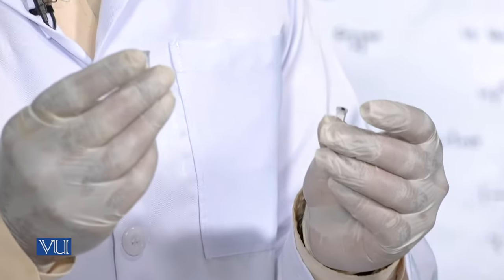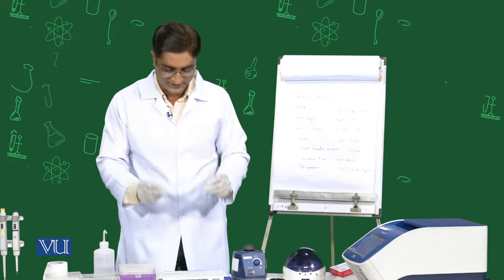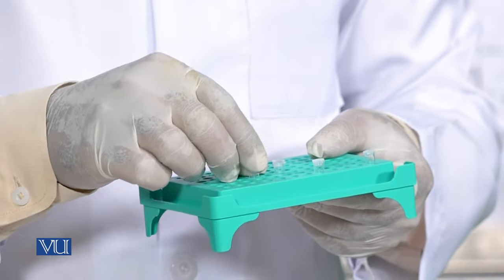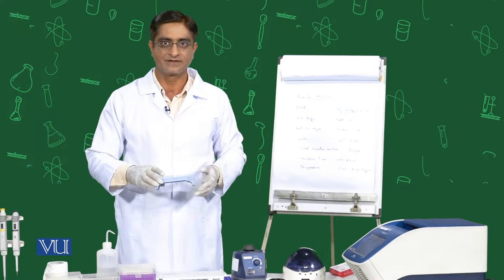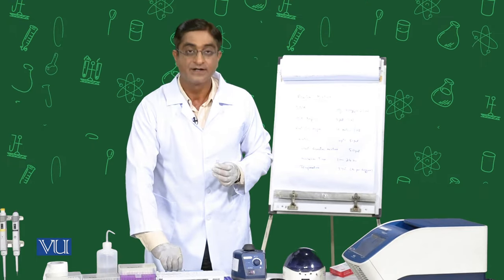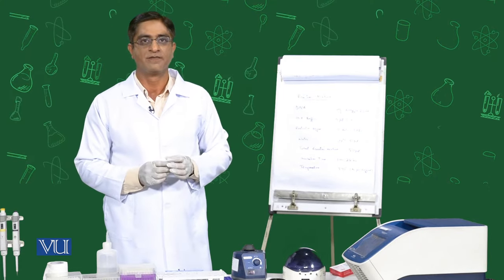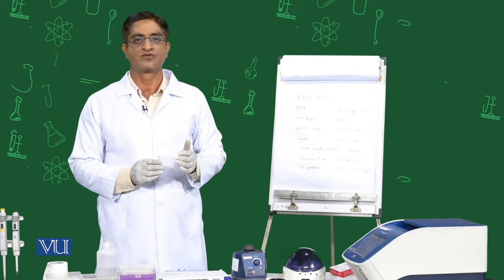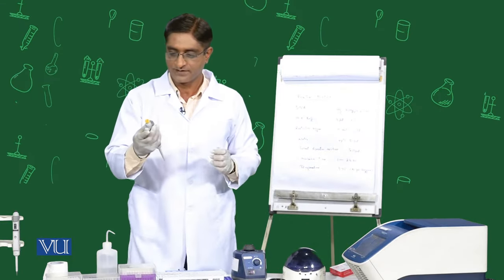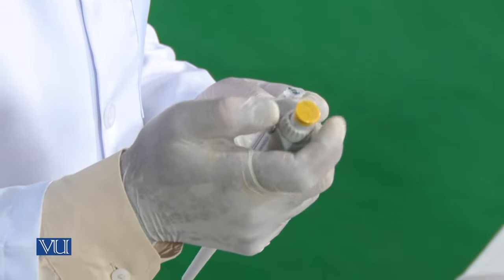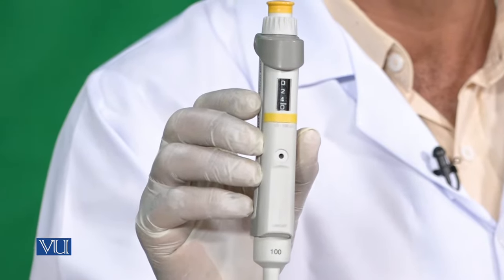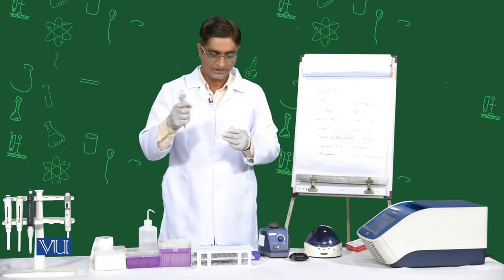We have two types of DNA, so we require two different tubes — PCR tube 1 and PCR tube 2. One for DNA sample 1 and the second for DNA sample 2. First, we will add water to our reaction tubes. We need 20 microliters of DNA, 5 microliters of buffer, and 1 microliter of enzyme — totaling 26 microliters — so we will add 24 microliters of water. I am taking the yellow pipette and adjusting it to 24 microliters.